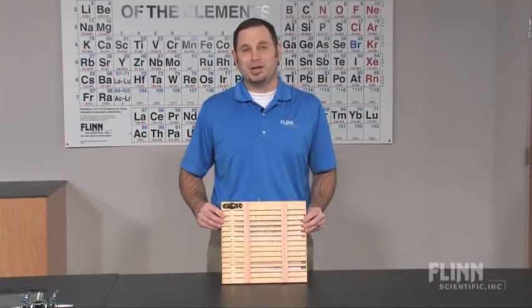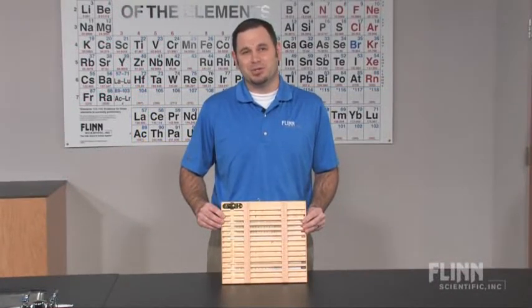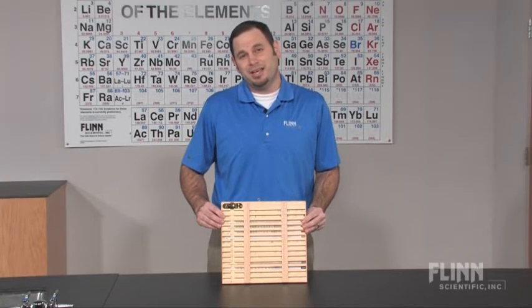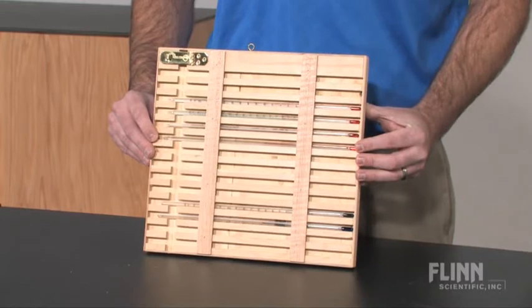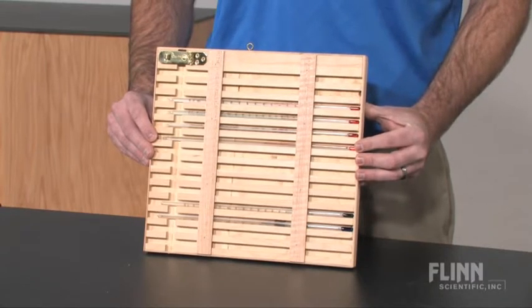Science teachers report that storing, transporting, and dispensing thermometers to students is a problem that needs a solution, and Flynn has the answer. Instead of having expensive thermometers roll around in a drawer, place them in this teacher-designed thermometer rack.